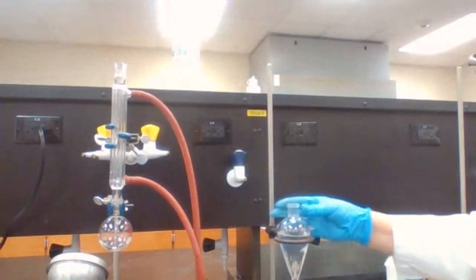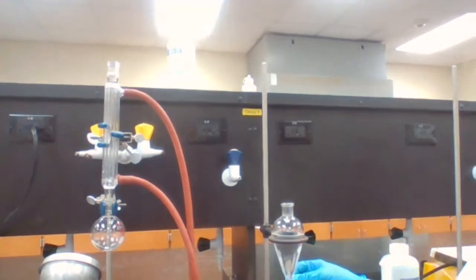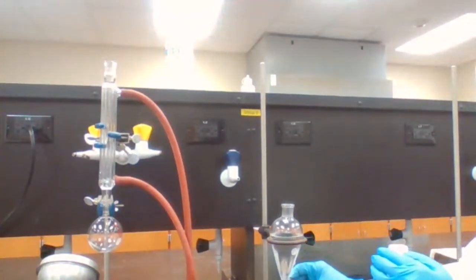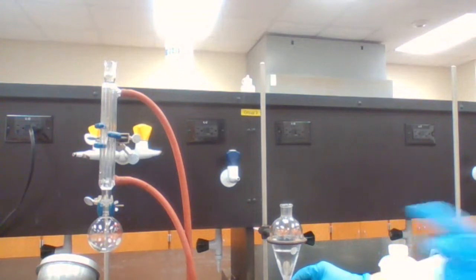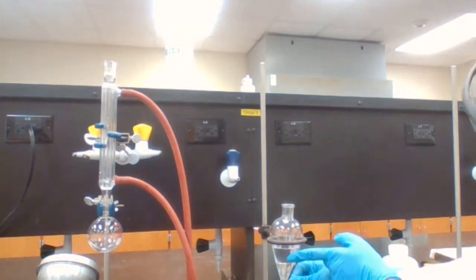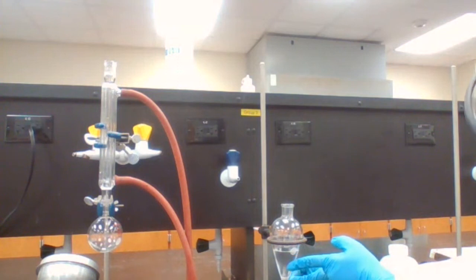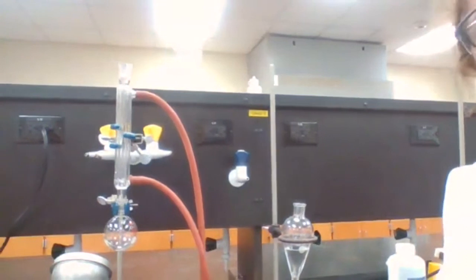Now that we have the two layers separated, I can open the stopcock and drain the bottom layer. You can take a screenshot at any time as we are doing the extraction. So I want two images with extraction: one showing the layers and another just the setup before adding the chemicals. Okay, I'm not taking the last drop because I don't want to lose any of the top layer. And we go to the next extraction.